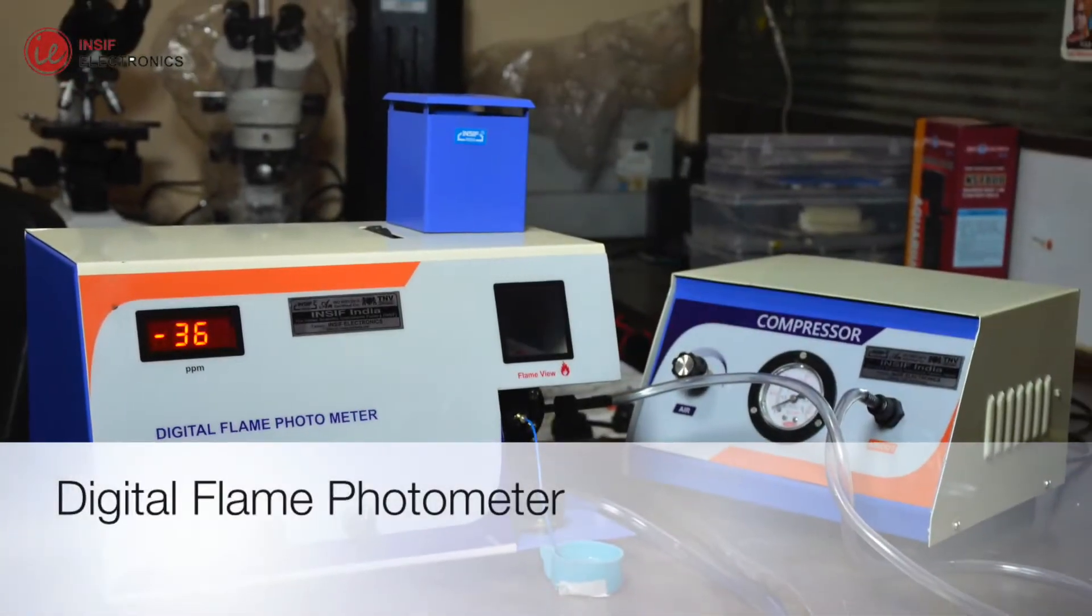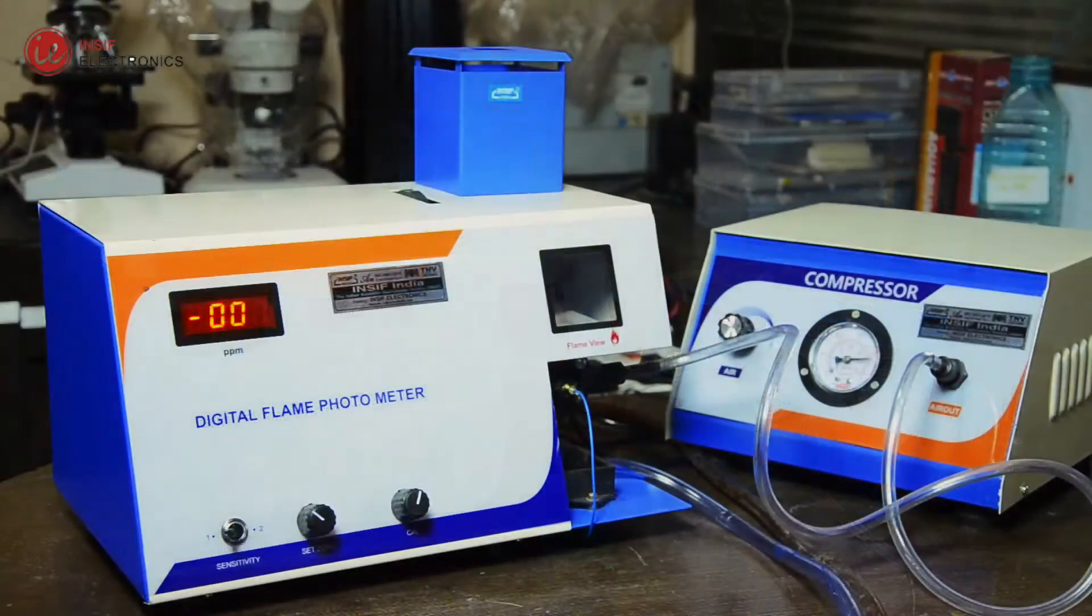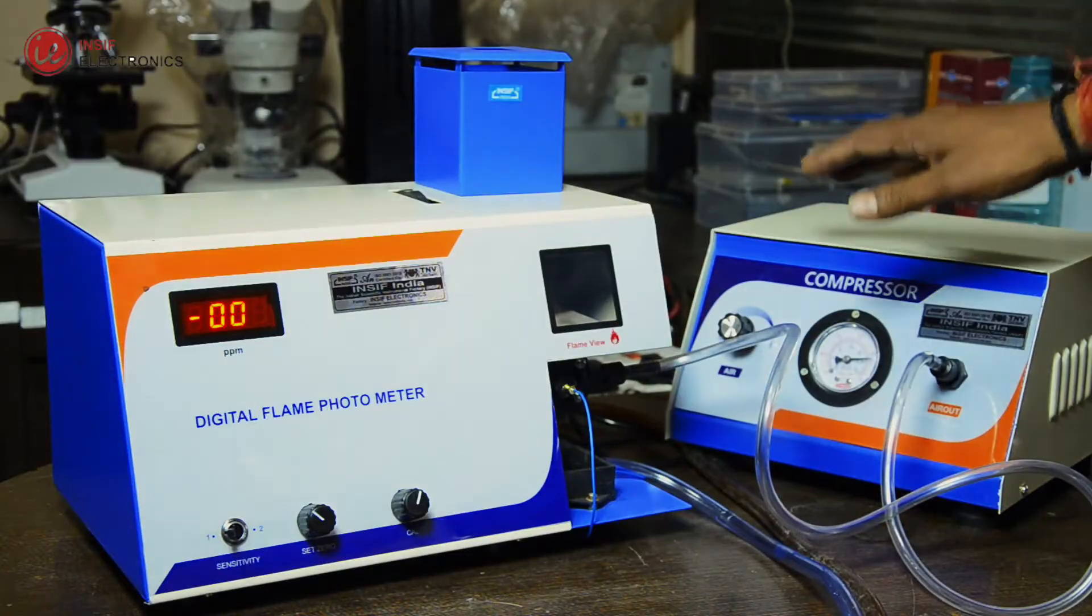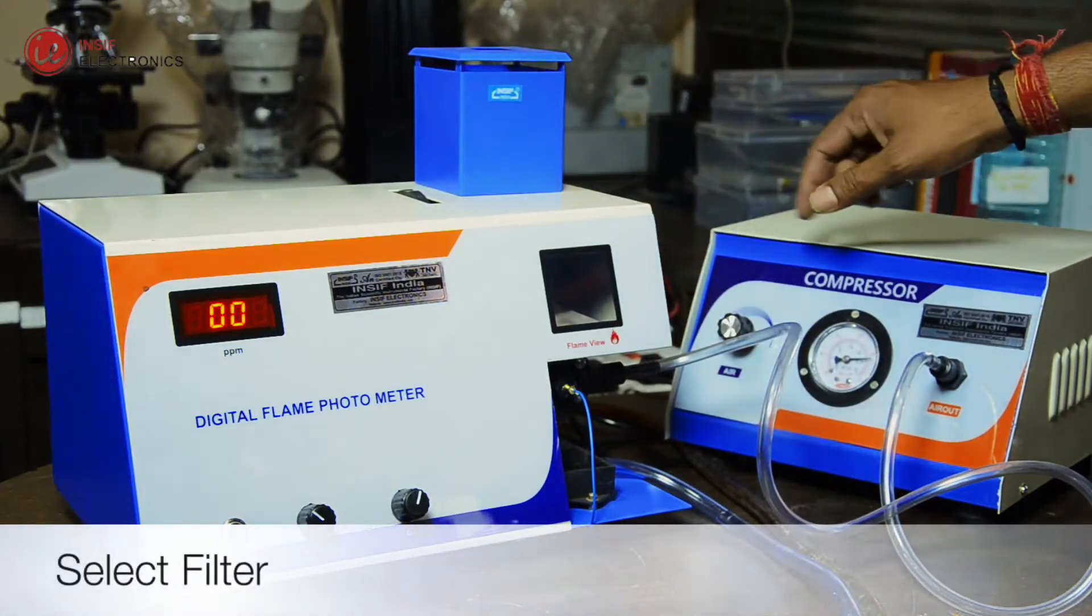Flame Photometer is used to determine the concentration of alkali and alkaline earth metals in various samples.